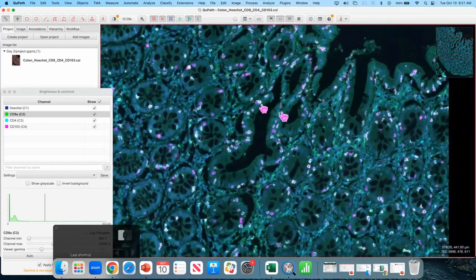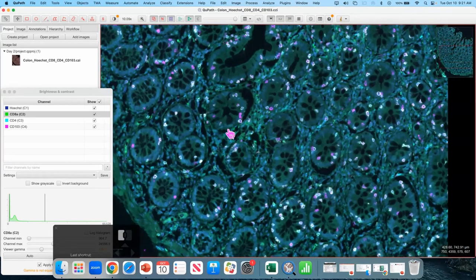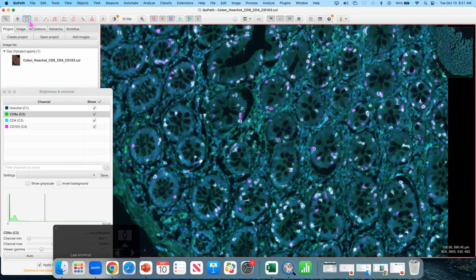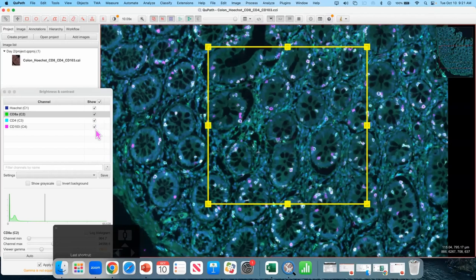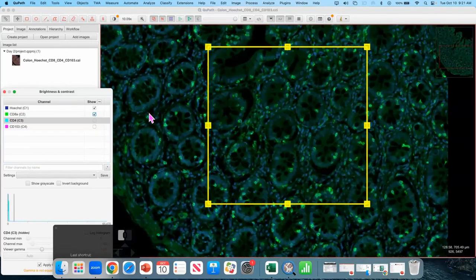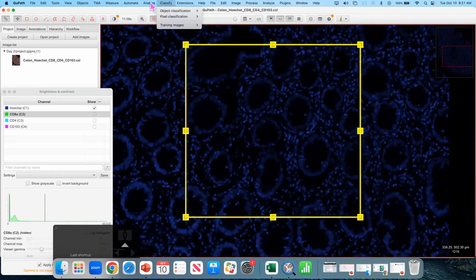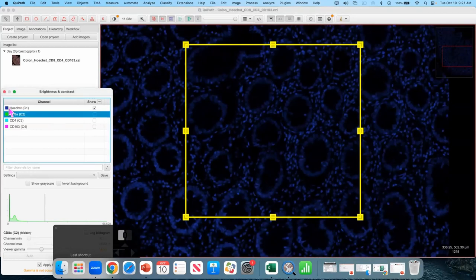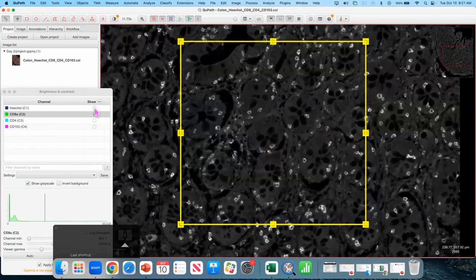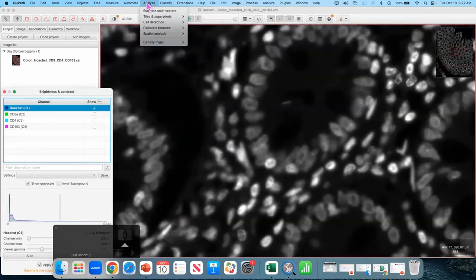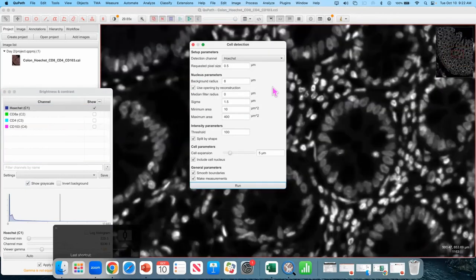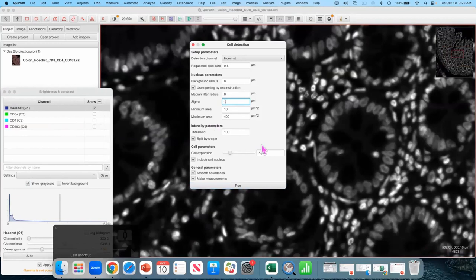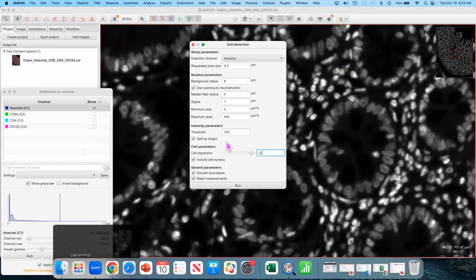And since most of you remember how to do this, we can do it fast. Though, I will say, this one's going to be harder than the ones we did yesterday. Analyze, cell detection. Probably around there. Something like that. And something like that. Yeah. Okay. Exactly. I will go back. That's good.